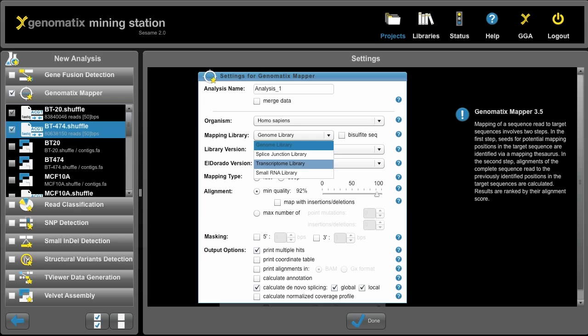For example, to call gene fusions we map against the genome and the transcriptome library to do a reliable gene fusion detection downstream of that. For now let's say we want to map against the genome.